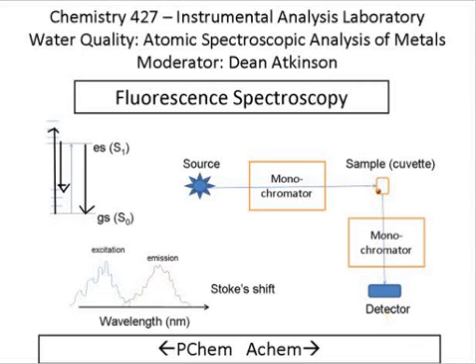And as soon as an analyte shows up in the cuvette, you would get a signal that's in principle very large at the detector. So essentially, the reason that fluorescence spectroscopy is considered a very sensitive technique is its zero background nature. And in fact, you might ask, how sensitive is it? There are experiments that have been done that have detected a single molecule sitting on a surface. So spectroscopy on a single molecule is now possible with fluorescence spectroscopy.